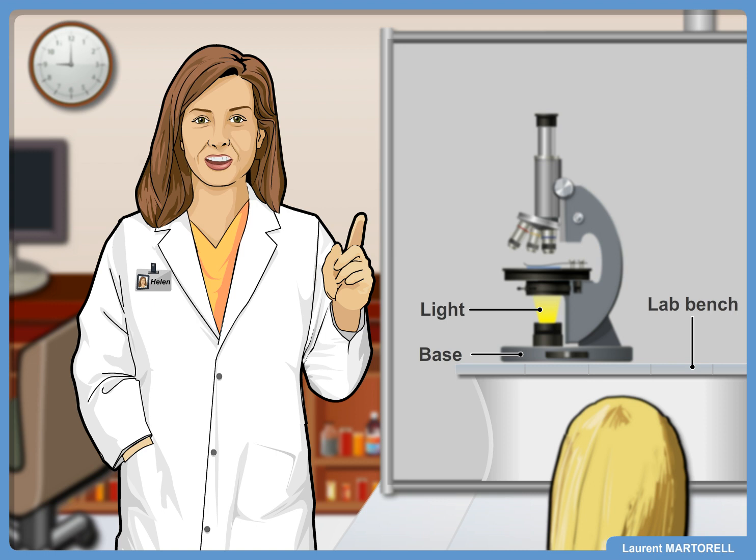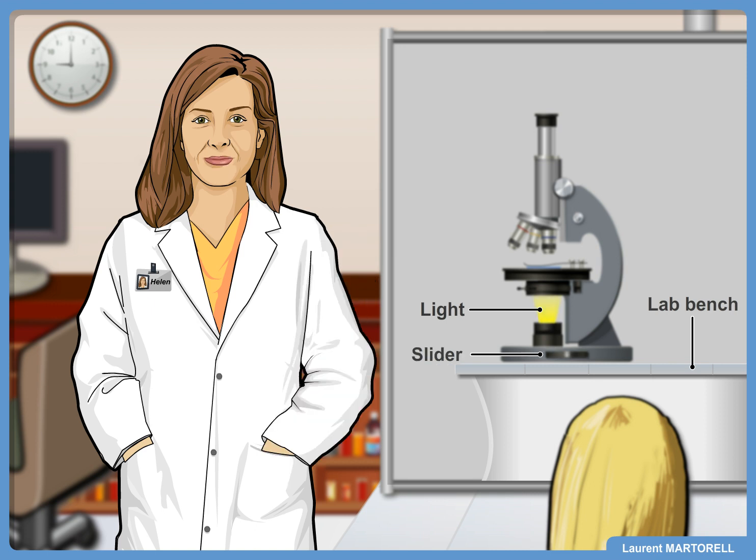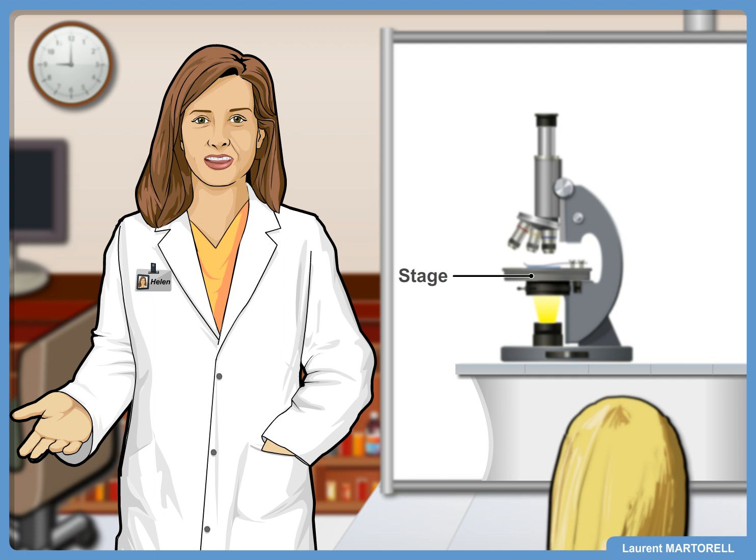The next part is the stage. The stage is the flat area that holds the slide. At the center of the stage is a hole that allows the light to pass through. It also has stage clips to hold the slide in place.